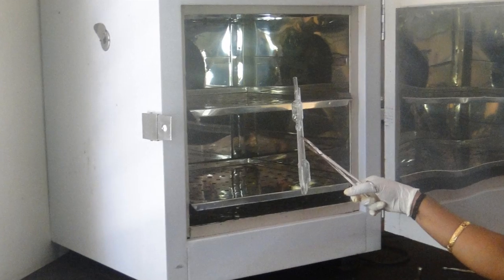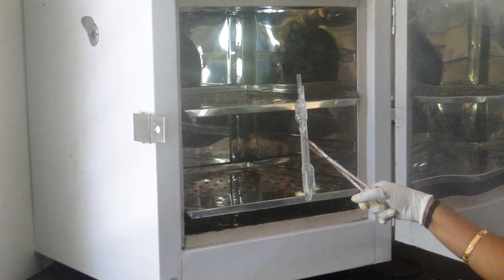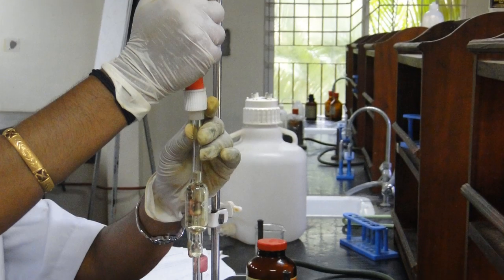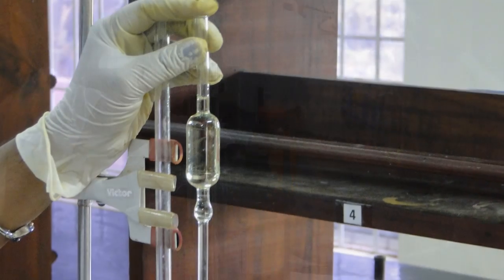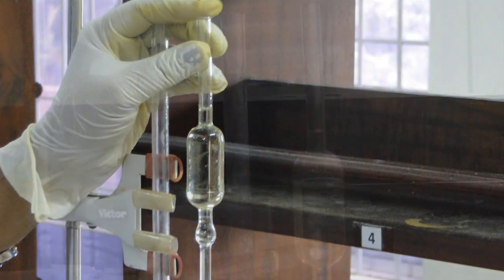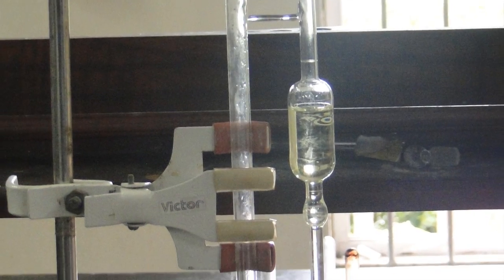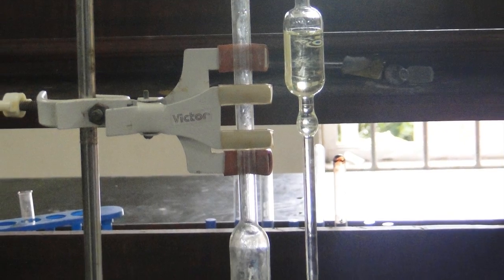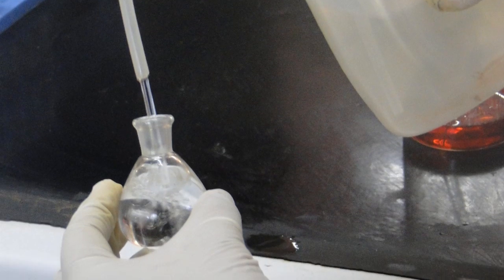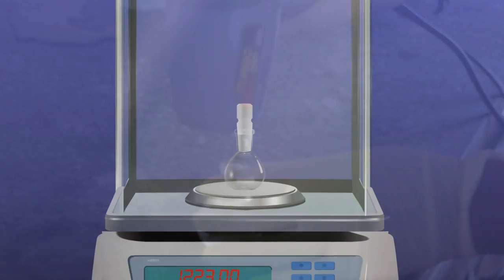Now remove the water from viscometer and dry it. Introduce in bulb B the same volume of liquid and measure the time of flow of liquid as before. Take at least three or four readings and then take the mean value. Now wash and dry the pycnometer or RD bottle and then weigh it empty.